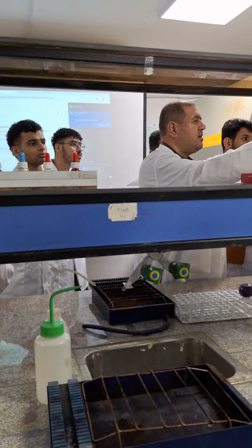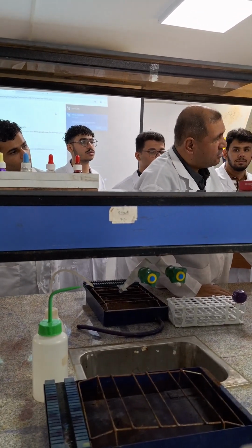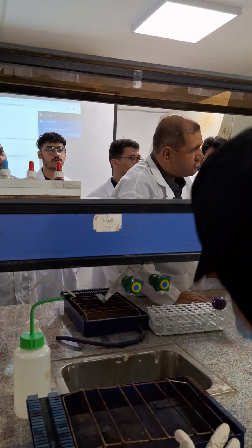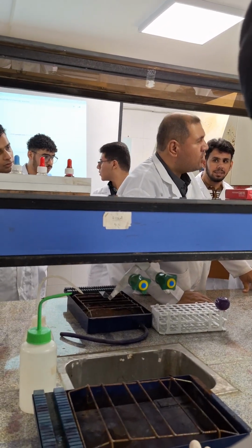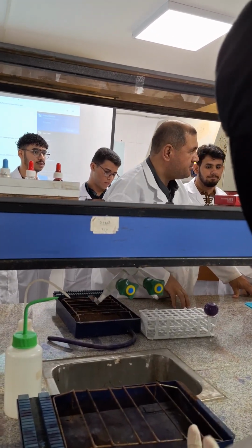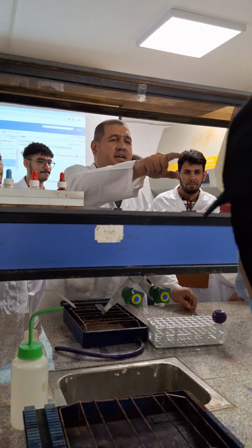What is the color of gram positive? Purple. Crystal violet shows the color of gram positive.